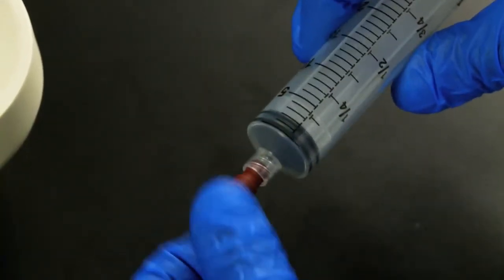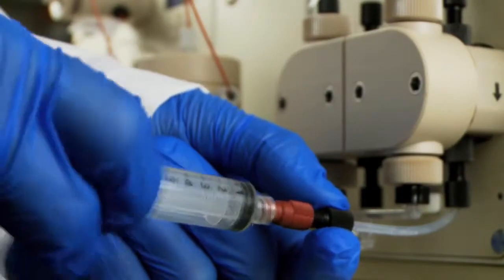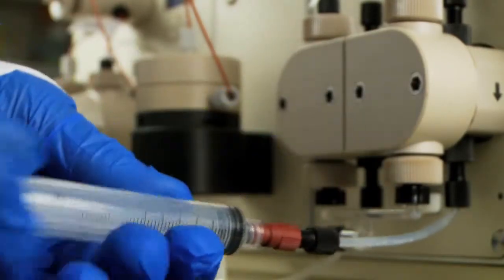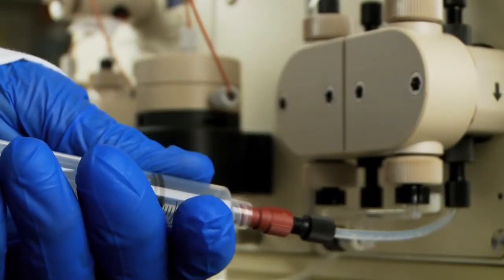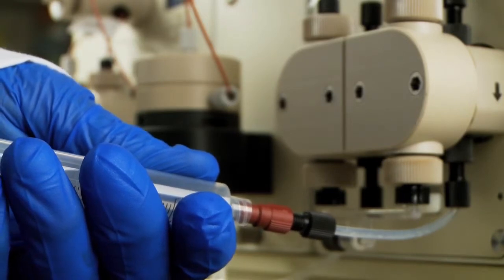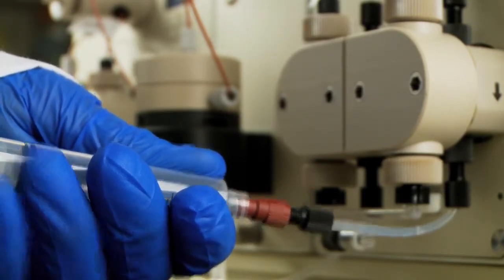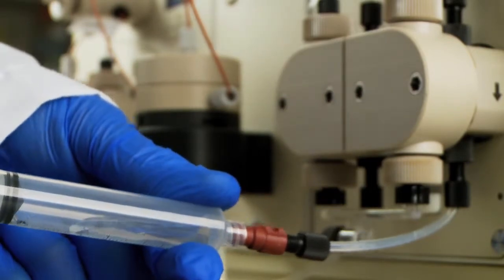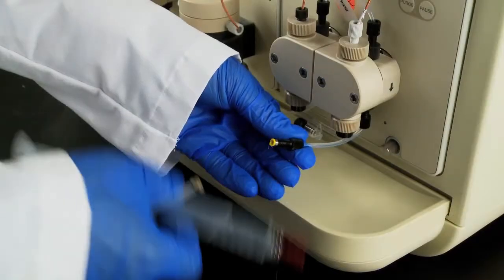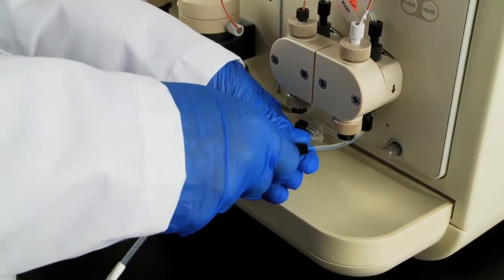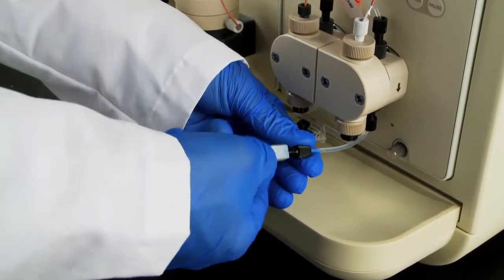Attach the quarter-twenty-eight lure adapter onto a 30 mil syringe and then join this assembly to the priming line. Withdraw the syringe plunger until washing solution appears in the syringe. Detach the syringe and adapter from the priming line and attach the outlet line with the union.